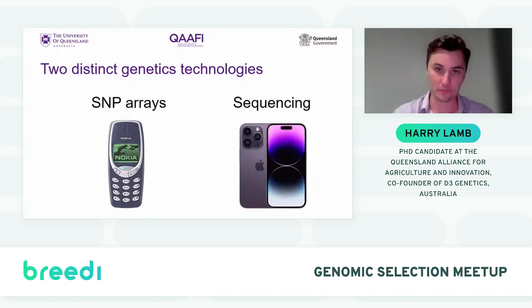I like to compare sequencing as a technology to iPhones in that not only can they send text messages, make phone calls, but they also offer things like internet, Snapchat, Instagram, and Facebook. So you get many other things out of sequencing than you can do out of SNP arrays.